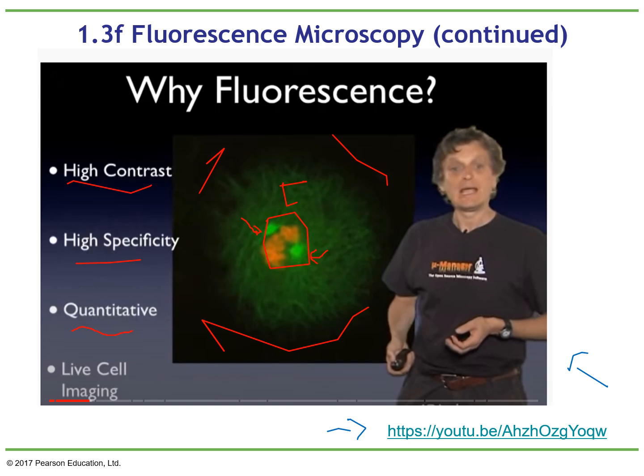You can also create a mutation, for example, in the microtubules, so you will not see a lot of that. So when there are few microtubules, maybe you cannot separate the chromosomes. So it can allow you to create these quantifications. And we are going to cover some of those things later during the semester, how to quantify all these pictures and how to study this process.